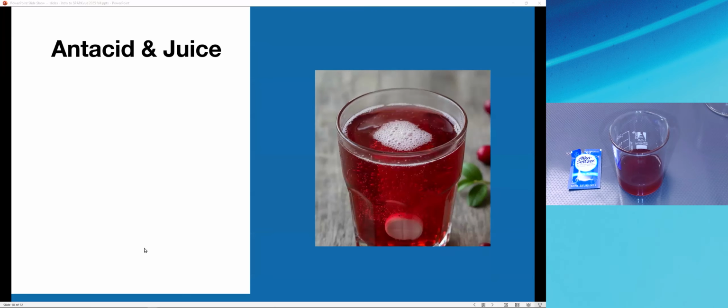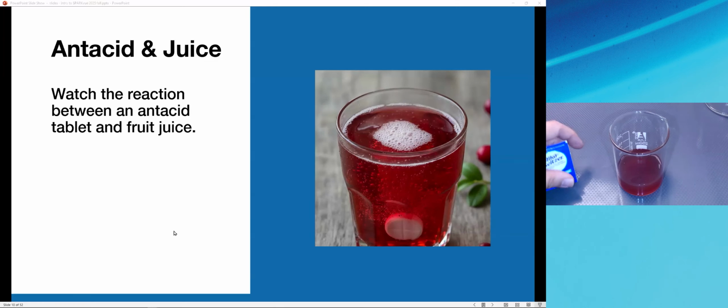Let's forget about the sensors for a moment. And on the live screen there, by the way, if you're joining us live, you have the ability to change the relative size of my shared screen and the live video feed. So you might want to expand the video feed here.